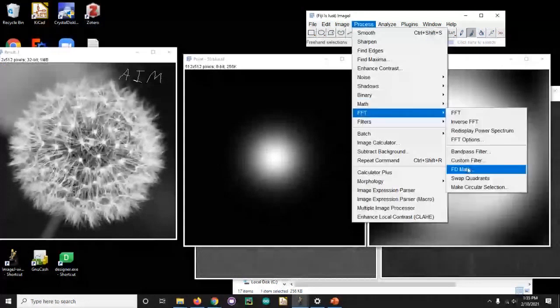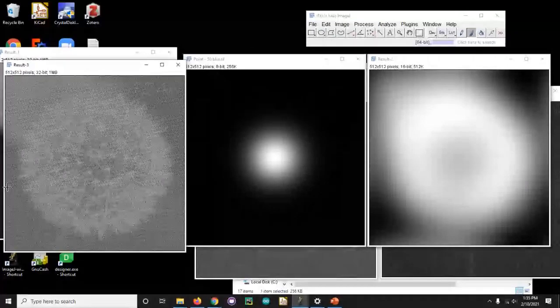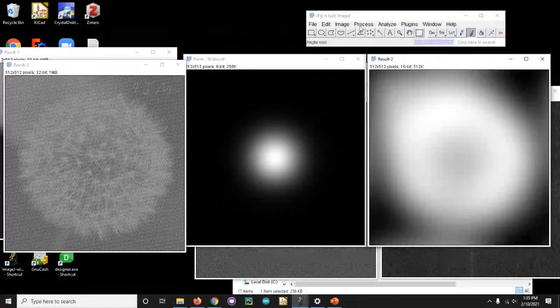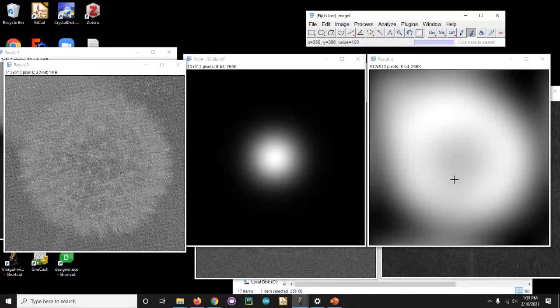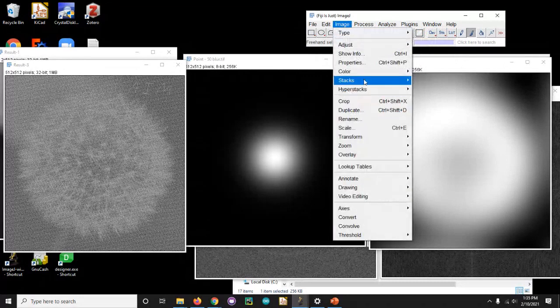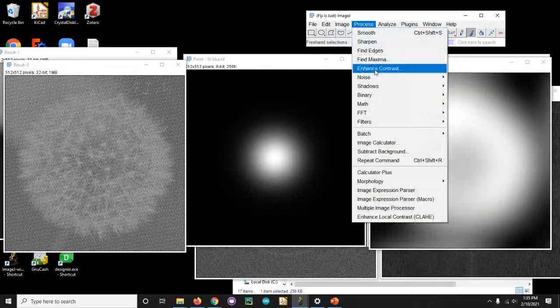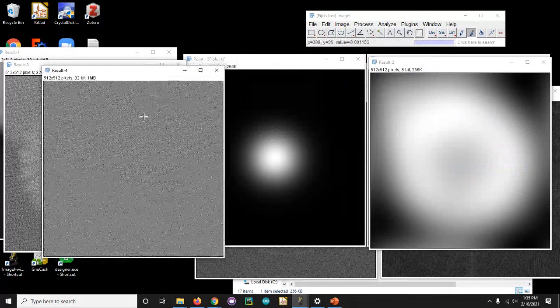Go to result. So I'm going to try and deconvolve result 2 from the same point spread function. And you see the vestige of the signal, but now it's a lot worse. And then if I go even further, so this gets into gathering as much information about your image as possible. So this is the exact same thing. It's now just with 8 bits of dynamic range. So with 8 bits of dynamic range, if I try and deconvolve it, there's nothing left. You couldn't tell anything about the original image.